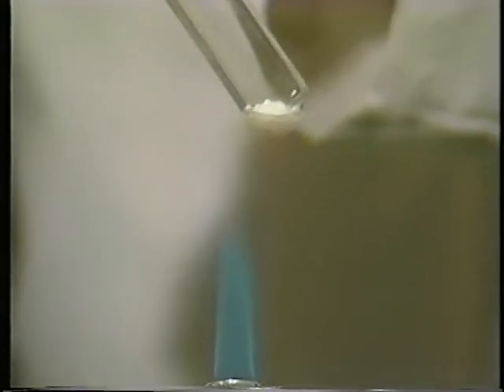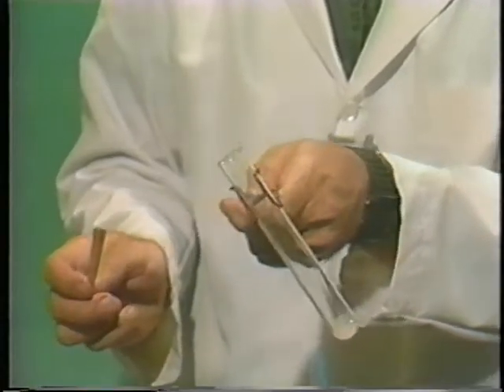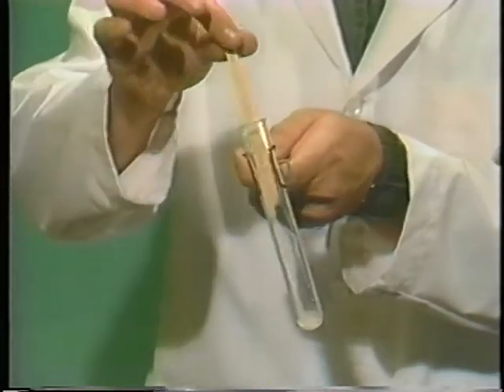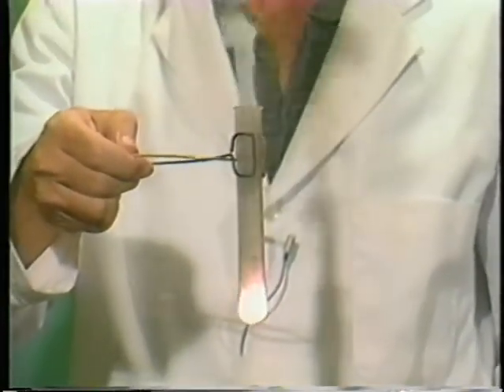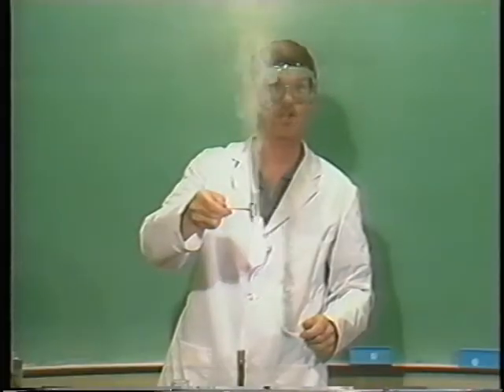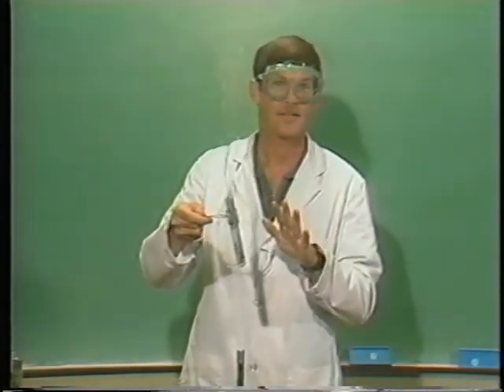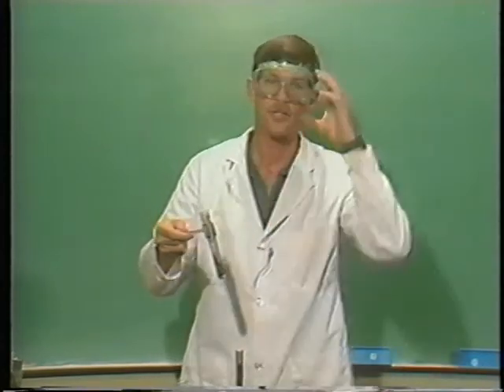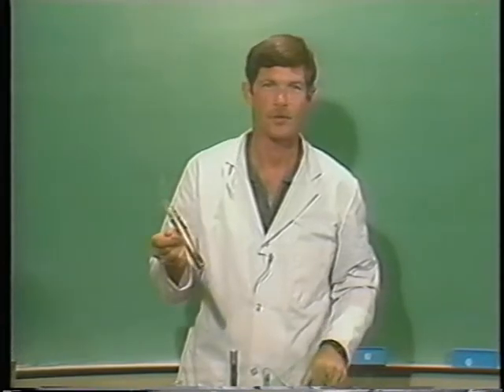First, we want to melt this down until it turns to a liquid. Then we have Mike in the back of the room, and he's going to put these little popsicle sticks in the chemical. Well, watch what happens. Uh-oh, Mike is in serious trouble. You can't hide something like that very easily in the science classroom. And this is a good example of what could happen to you if you tried an unauthorized experiment.